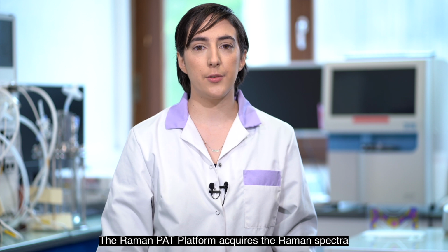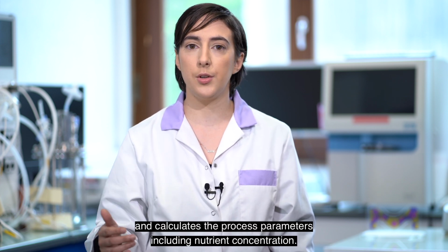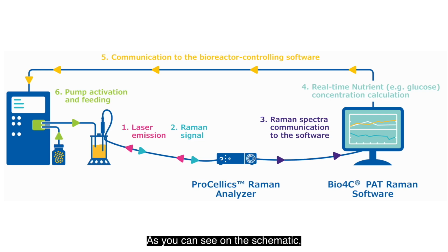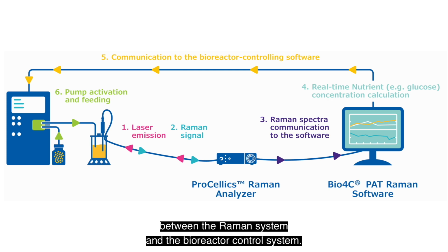The Raman PAT platform acquires the spectra and calculates the process parameters, including nutrient concentration. As you can see on the schematic, a feedback control loop can be implemented using a direct OPC UA connectivity between the Raman system and the bioreactor control system. This setup allows you to implement an automated feeding strategy.